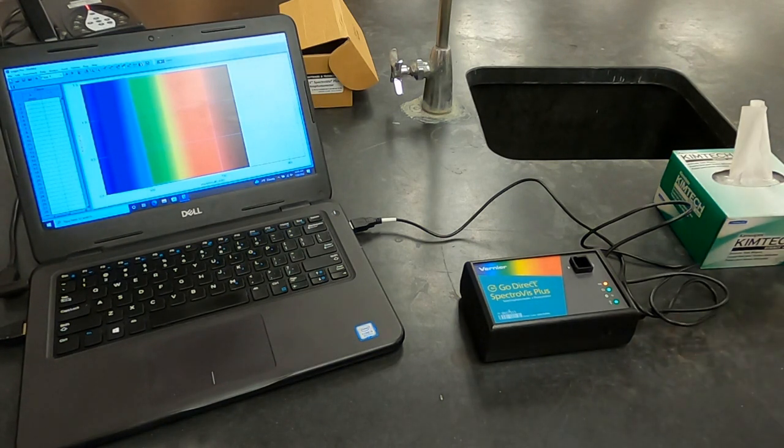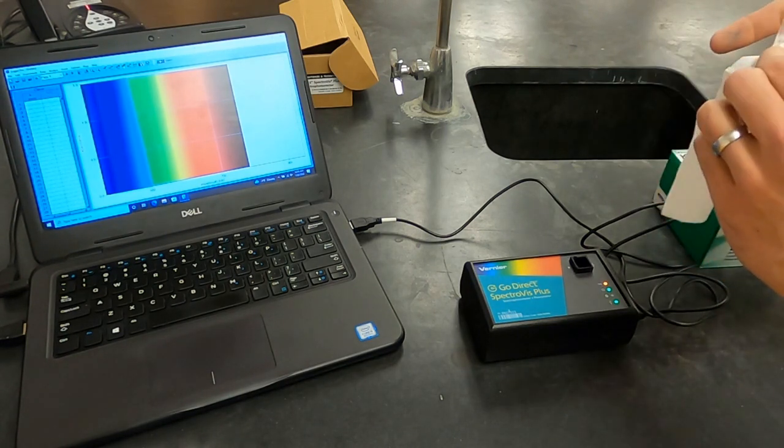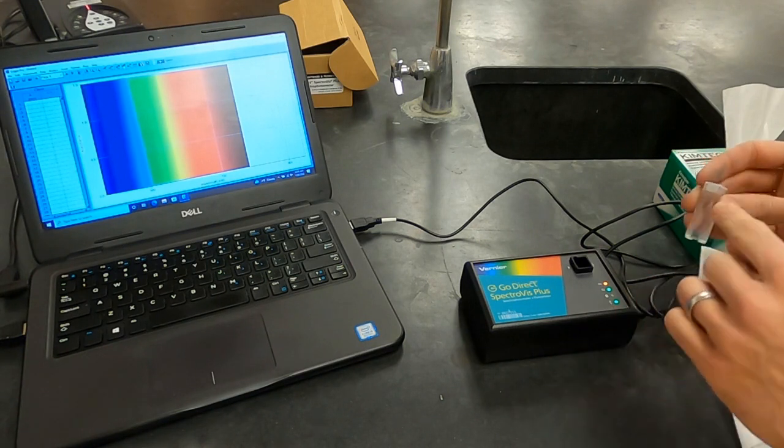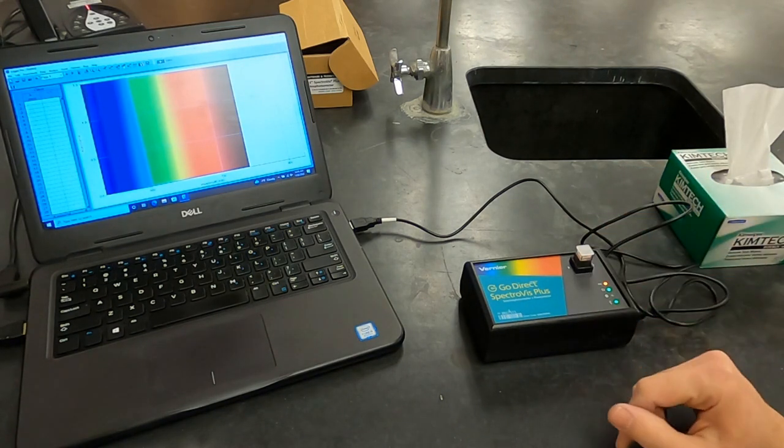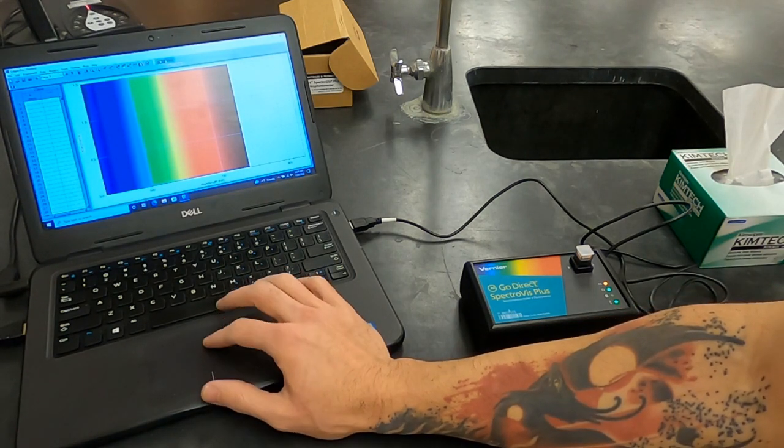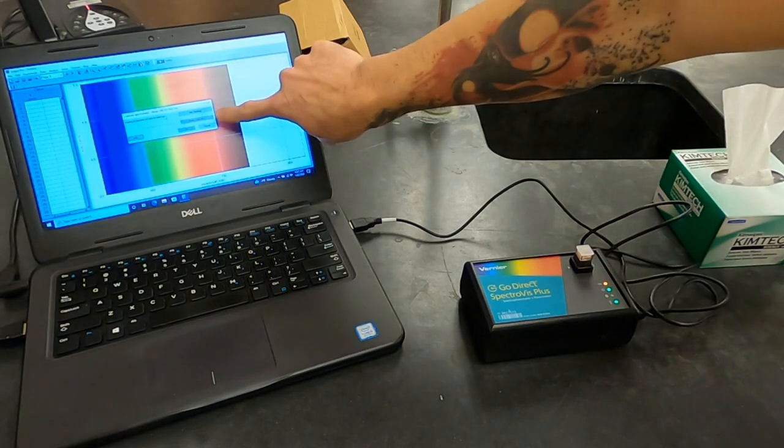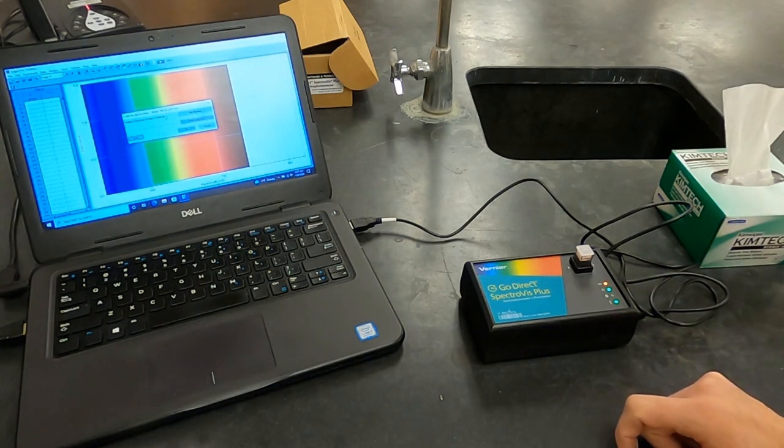Now that we've got this going, you take one cuvette at a time starting with your blank. The Kim Wipes, you wipe them down, especially the smooth sides. You want these to not be wet and you want them to not have fingerprints because your fingerprints could interfere with the light path. The smooth sides need to be in line with the light path. When you have your blank in, you're going to hit collect and this is only for the first time it's going to do this. It's going to need to warm up, so it will take 90 seconds to warm up. It will give you the option to say finish calibration when it's ready. And when you click finish calibration, you must have your blank in. At that point, it will be calibrated and you're ready to go one sample at a time.